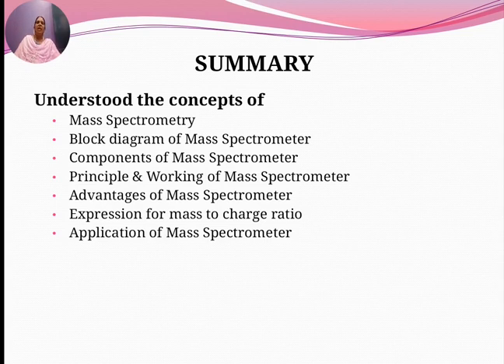The 3 basic components of a mass spectrometer are the ion source, mass analyzer, and detection system. In the ionization source, the molecules are converted to gas phase ions so that they can be moved and manipulated by external electric and magnetic fields. A technique called nano electrospray ionization is used, which produces positively or negatively charged ions depending upon the experimental requirement.